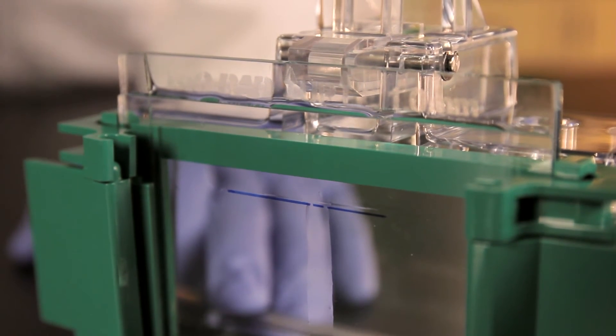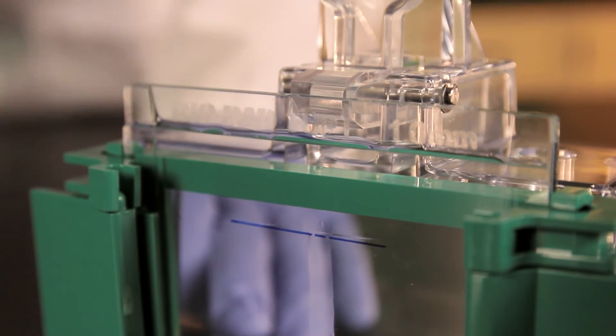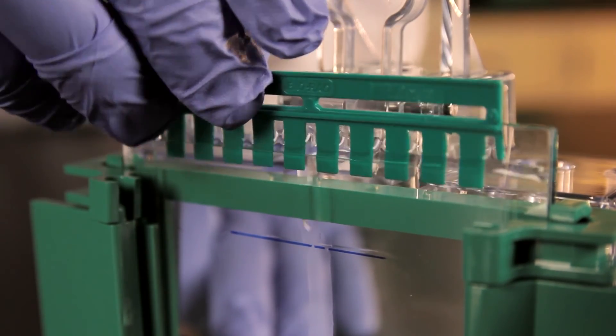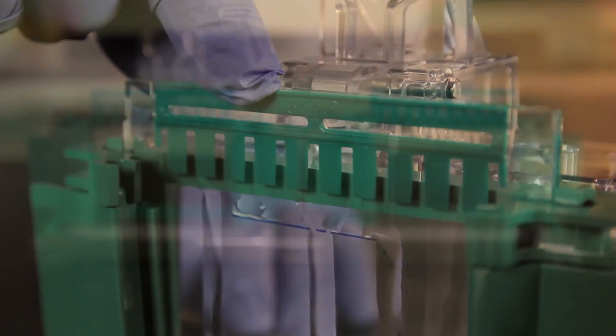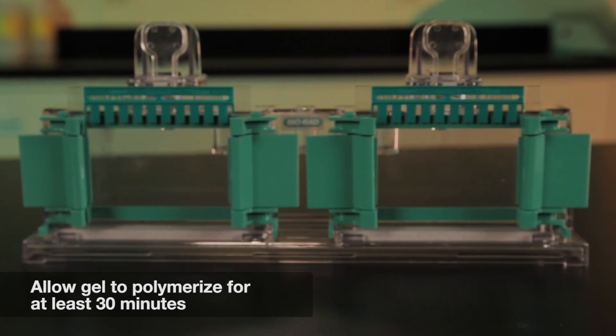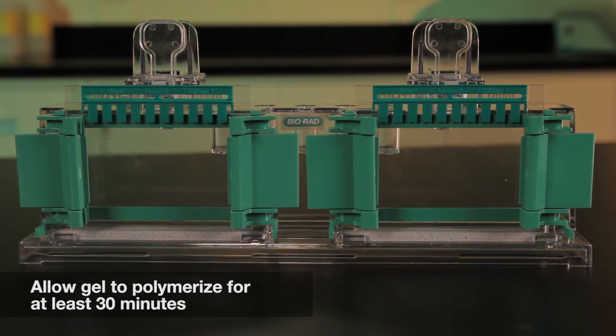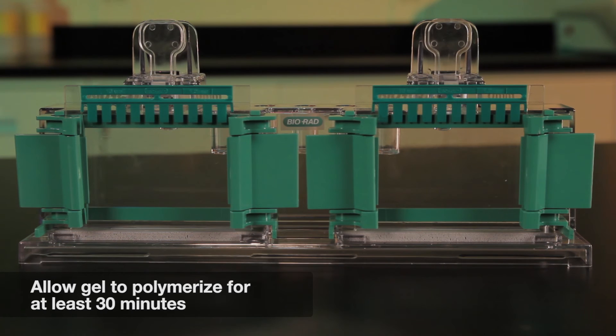Next, insert the comb into the cassette, taking care to avoid trapping air bubbles under the teeth. Allow the gel to polymerize for at least 30 minutes. You are now ready to run your Bio-Rad TGX FastCast gel.